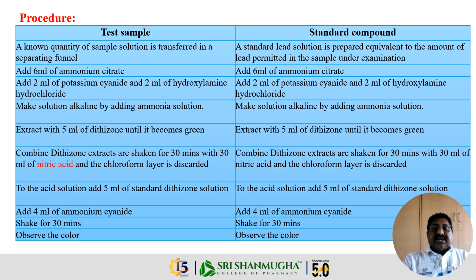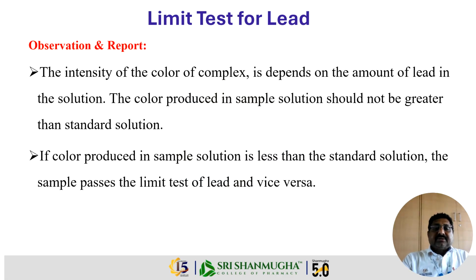Repeat extraction until green color appears. Add nitric acid and extract again with dithizone. So prepare standard solution similarly. So compare the color of the test and standard. Observe the color of the complex formed. The intensity of color depends upon the amount of lead present in the sample.